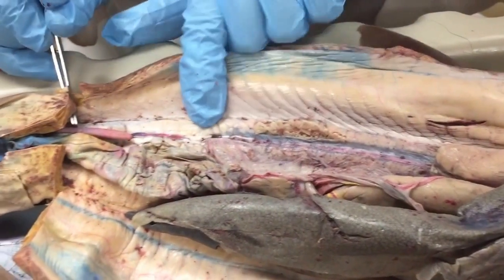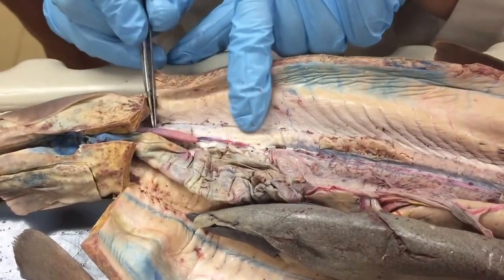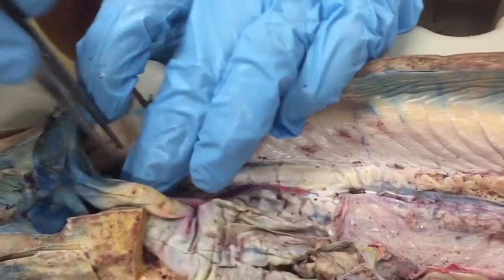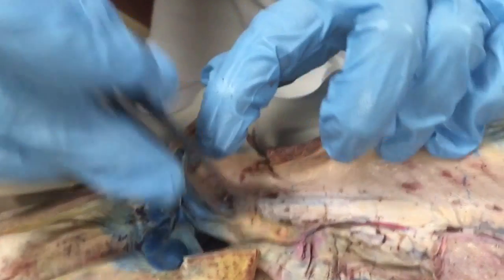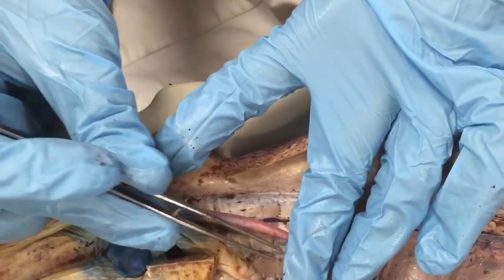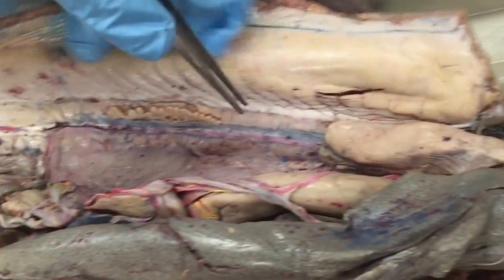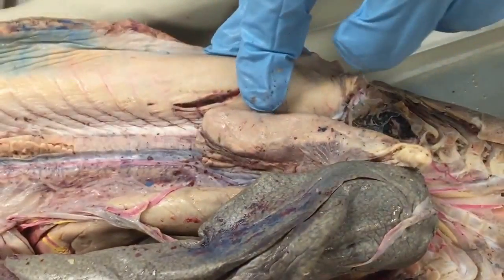And then this lower section in the males is the seminal vesicle. It's more like a flat pouch, whereas the sperm sac is more of a bulbous pouch, way down at the bottom of the rectal gland here, right? The rectal gland also has a salt excretion function. So I've got the sperm sac down here, seminal vesicle here, the ductus deferens running on top, the kidney, the Leydig's gland up here, and the testes here with your mesorchium, mesentery.